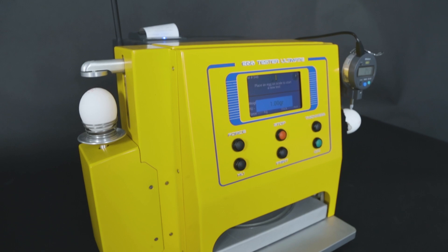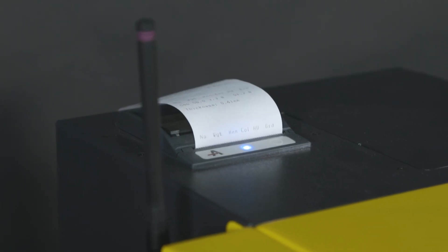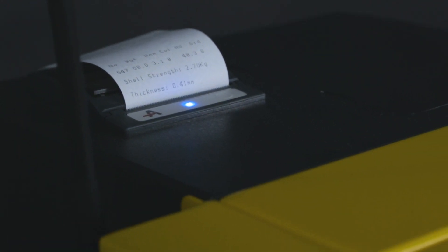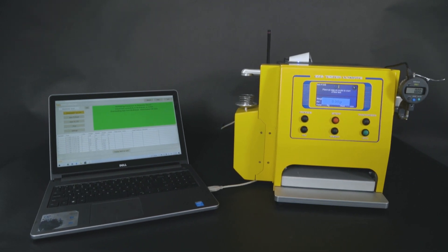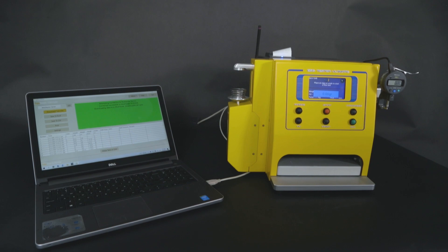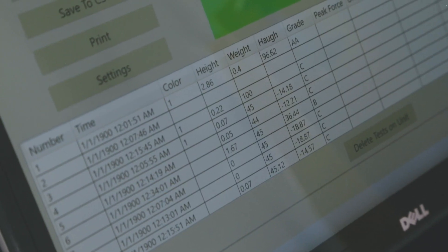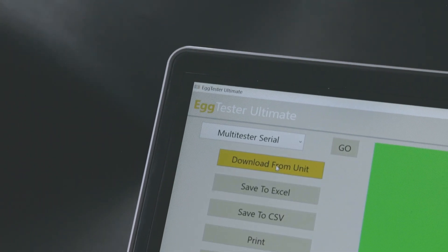You then have the option to test the eggshell thickness using the built-in gauge. The Egg Tester Ultimate automatically calculates and stores thousands of measurements in its built-in memory, allowing for continuous testing. Results of each test are printed using the built-in printer. The Egg Tester Ultimate can also be connected to an external PC via USB cable or wirelessly via Wi-Fi network.